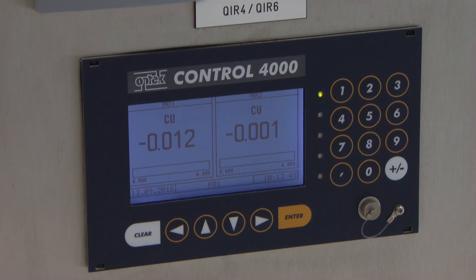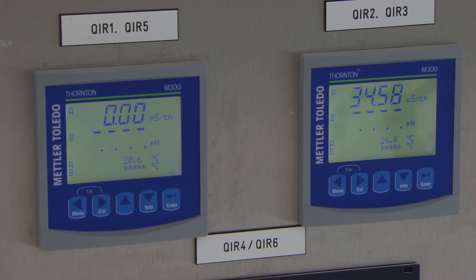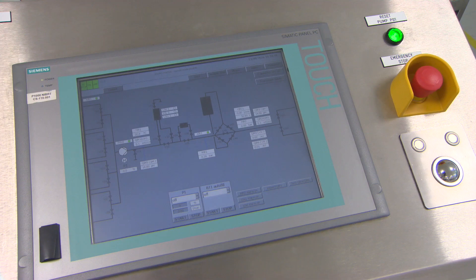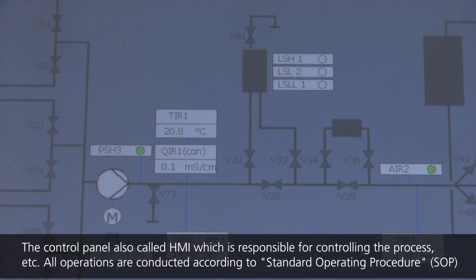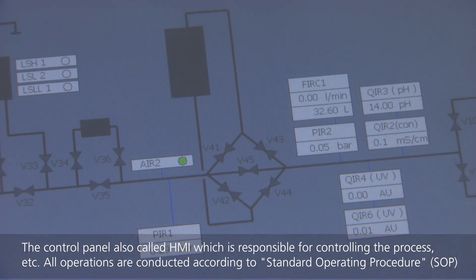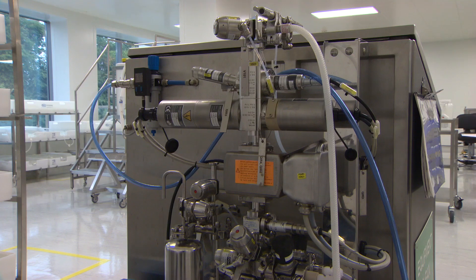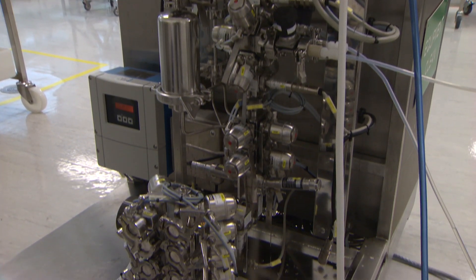The control console houses various instrumental gauges which allow individual monitoring of various critical process parameters during a chromatography operation. Several parameters may also be monitored through a HMI, or human machine interface, at the front of the console. This HMI also allows control of the pumping speed and operation of valves controlling liquid flow throughout the system.